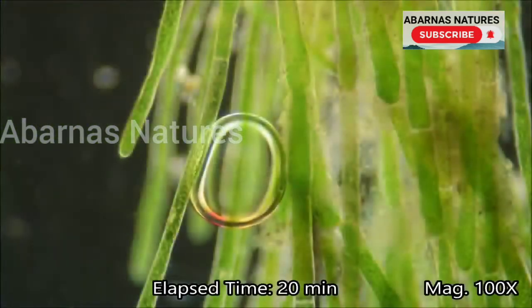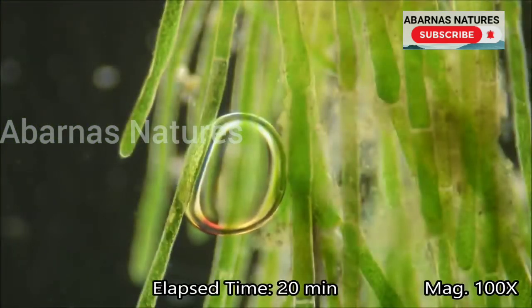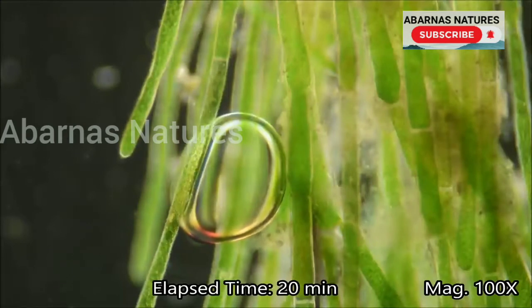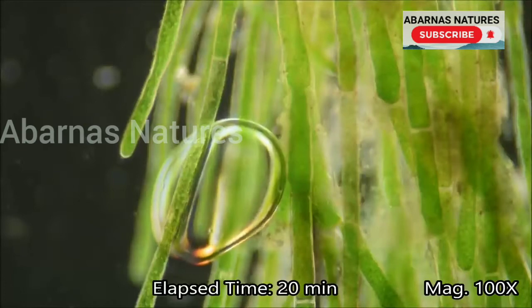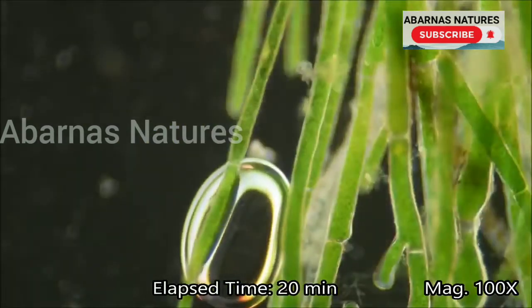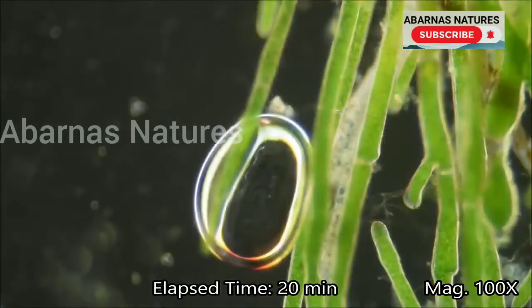Photosynthesis is a process used by plants, algae, protists, and some bacteria to produce carbohydrates and oxygen from water, carbon dioxide, and sunlight. Organisms use photosynthesis to create food for themselves in the form of carbohydrates.